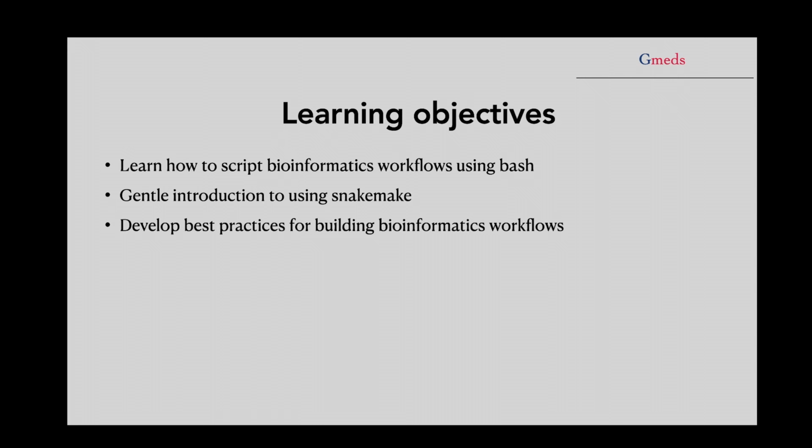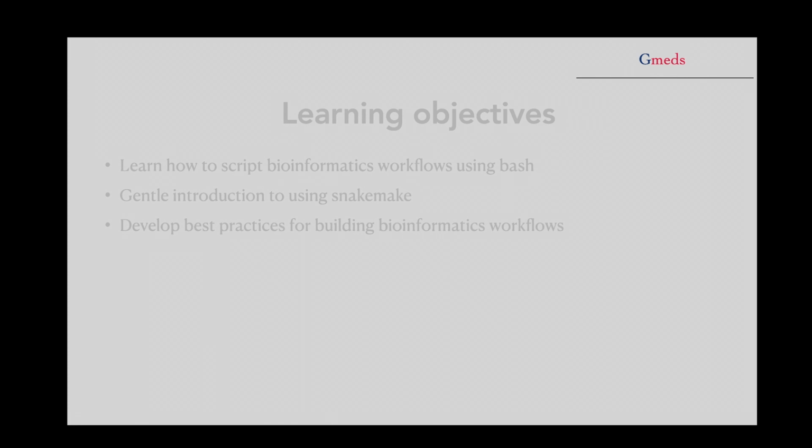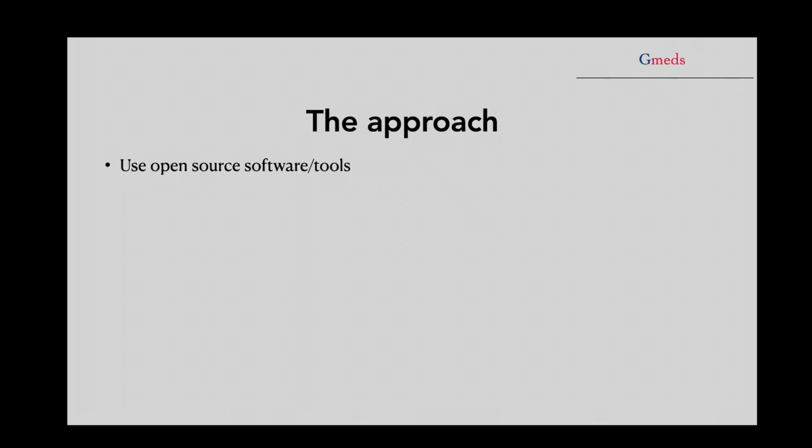Now, we will have a simple approach to these tutorials. And the first approach that we will use is that we will use open source bioinformatics tools and softwares. My reason for choosing these tools and softwares is because they are so easy to install and pretty much you will not need to spend any amount in them. But even so, the most fundamental issue here is that there is a robust support on these tools that you can find online, just in case you run into any issues.